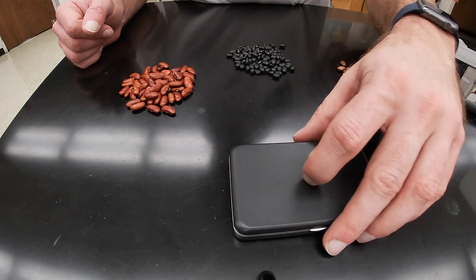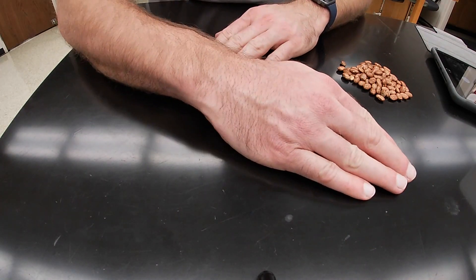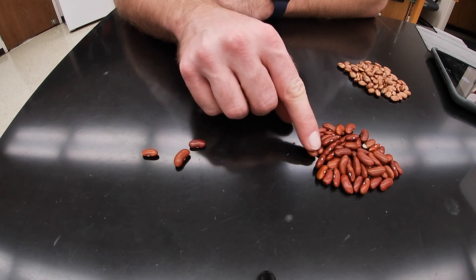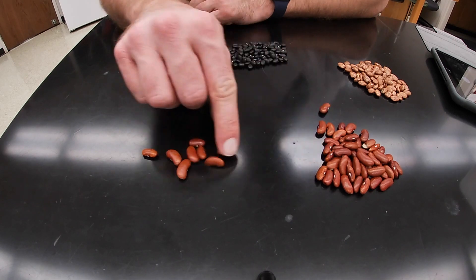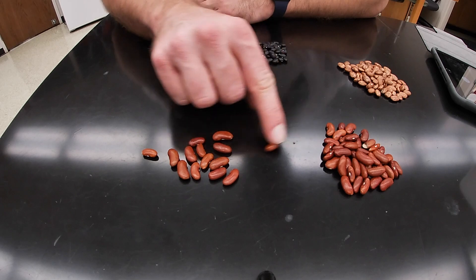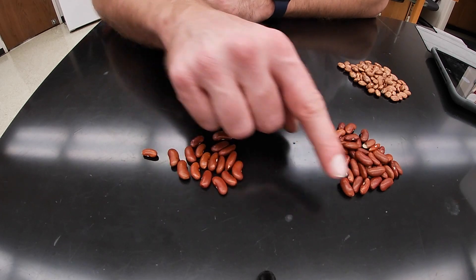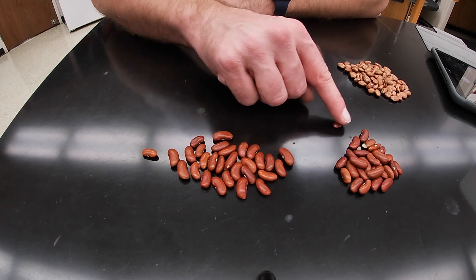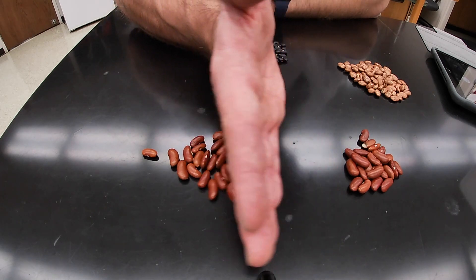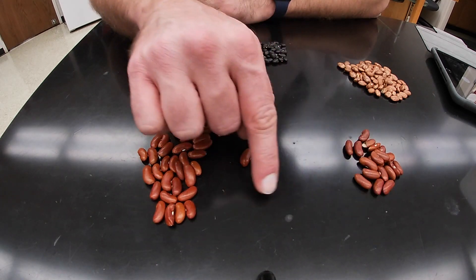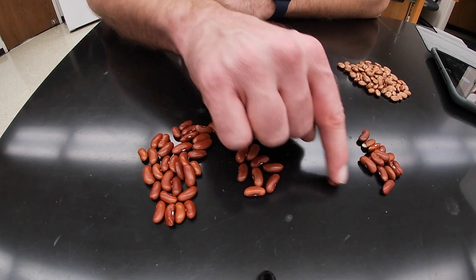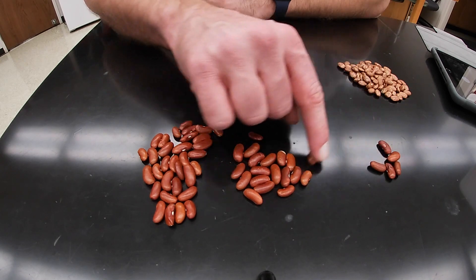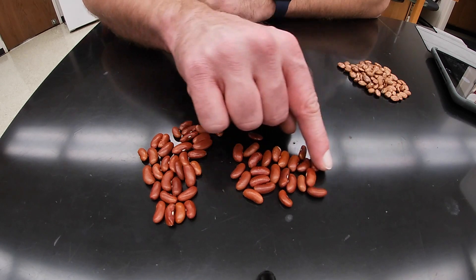We are done using the balance, so we'll get this out of the way and we are going to count the beans. Since this is a virtual lab, you are going to be counting and I'm going to be manipulating. Here's one, two, three, four. That's all the red beans.